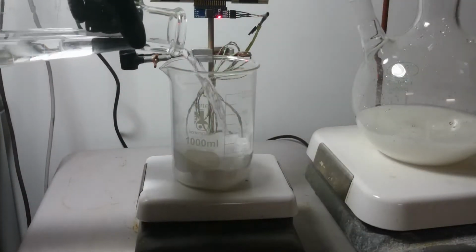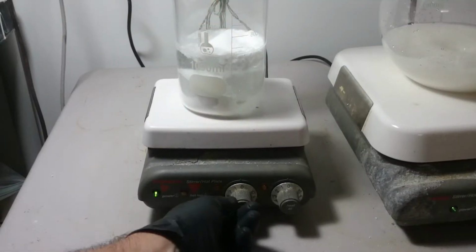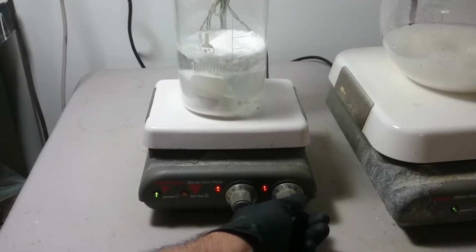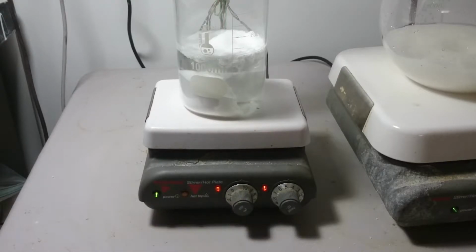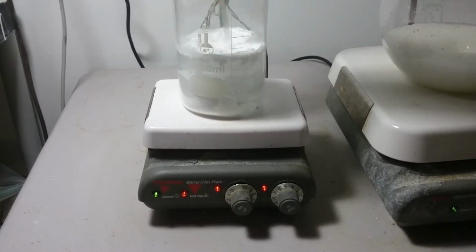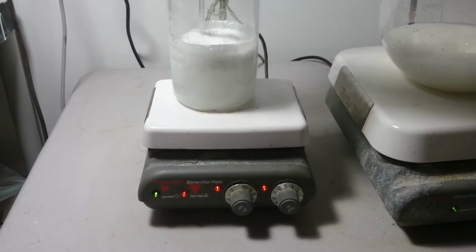Sodium propionate is useful mainly as a precursor to propionic acid. Propionic acid can be used for a number of things, but I plan mostly to use it in esterification reactions. While calcium propionate can be reacted directly with sulfuric acid to make propionic acid, it's an undesirable reaction because of the calcium sulfate produced being insoluble in pretty much everything and gumming up the reaction. Distillation and filtration are not particularly effective at separating it.